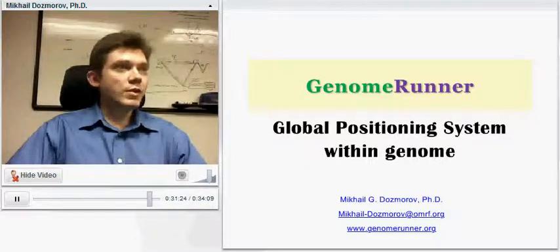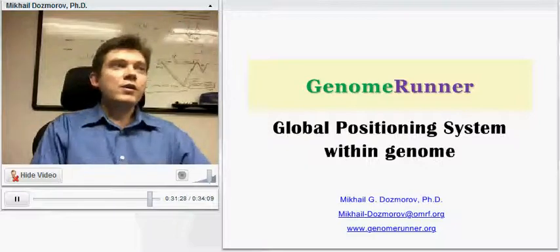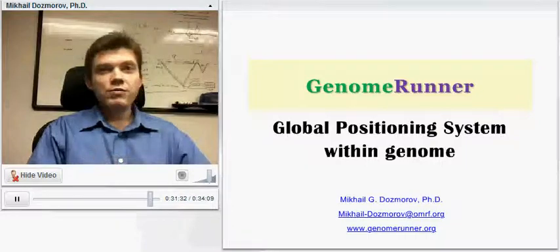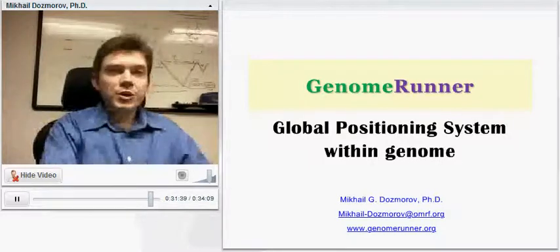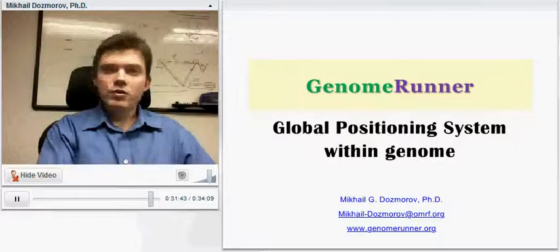And the question I got: can we check CGH data? The answer is yes, we can. You have to know where your CGH regions are located, and yes, Genome Runner can provide information on what's so special about those regions.